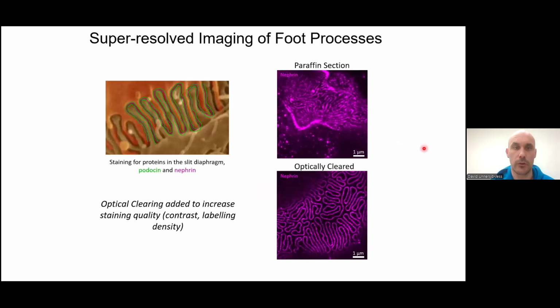Hans will give a presentation later in the week about super resolution microscopy. For the sake of time, I don't have time to present it, but you will hear about it. Super resolution microscopy increases the resolution of a fluorescence microscope. It builds on a confocal microscope, but you can increase the resolution by a factor of 10 or so. Then the resolution should be enough to visualize these structures with such a microscope.